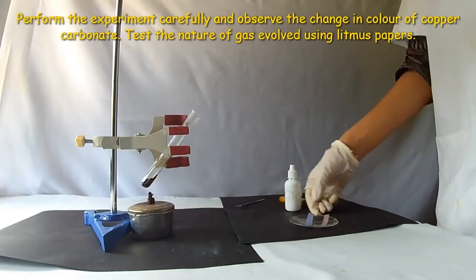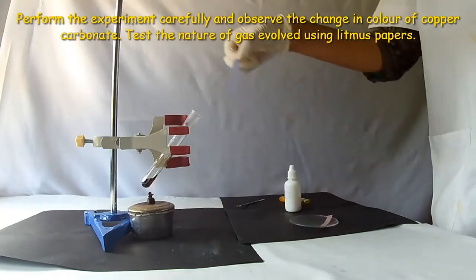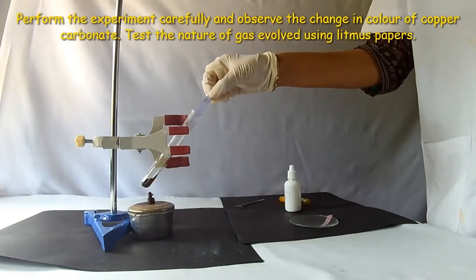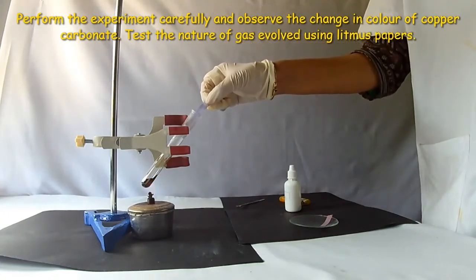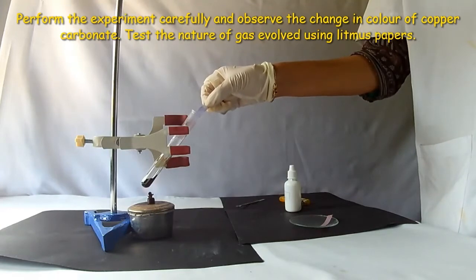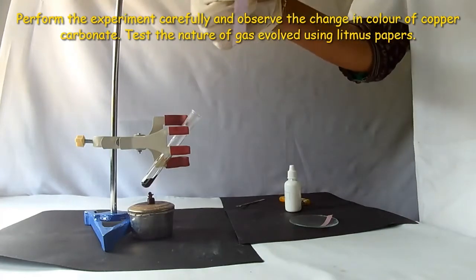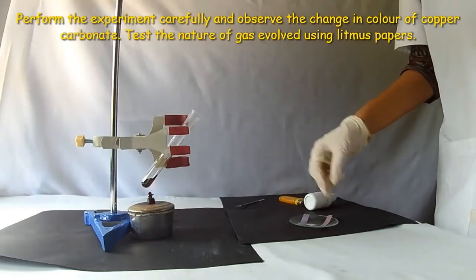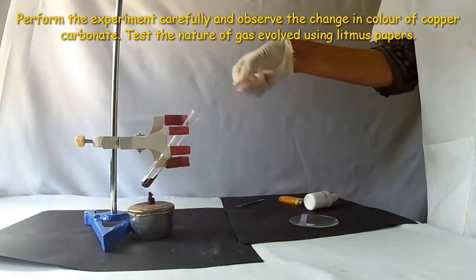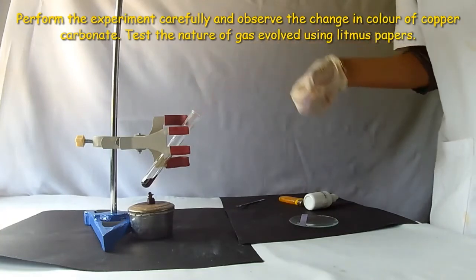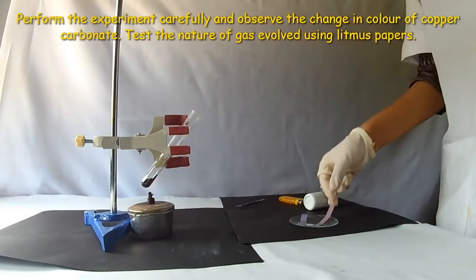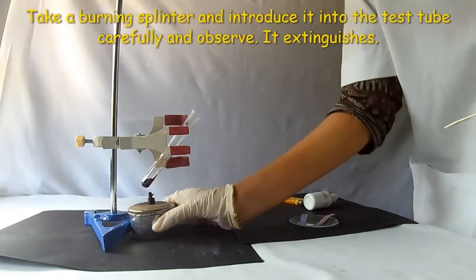Now, test the nature of the gas that is evolved, that is carbon dioxide. Insert blue moist litmus paper into the test tube. Observe the change in color. It changes slightly to red. There is no change in color when red litmus is introduced, thus proving that carbon dioxide is acidic in nature.